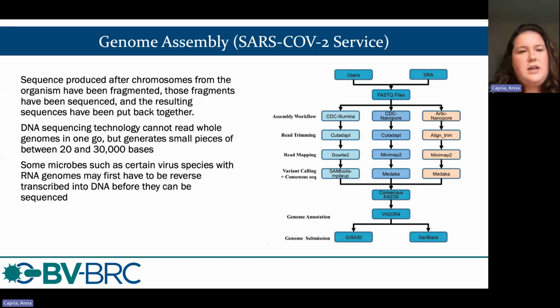about how data can enter the BV-BRC. You can use our database and pull data, or you can use the SRA accession numbers, or you can have your own data from your sequencing projects that you load up in a private workspace. We never see it. It's kind of like a Google Drive folder, and that was something that we talked about in the last webinar. So once those links are live, you can review that or any of the help documentation about how to make a workspace if you're unfamiliar.